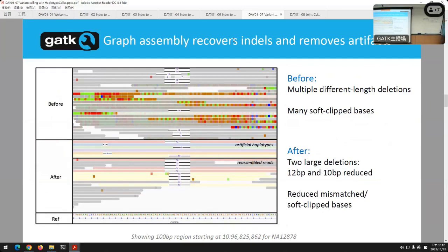Biologically, this is also the case where the human genome messes up. This is how PCR, everything happens. You have slippage in the biological mechanisms. And so there were actually truly 2 deletions here. But if you look up top, there are deletions of 8 bases, 10 bases, 12 bases, 7 bases. There are lots of those discolorations. That means they're SNPs, but they're all in a row.